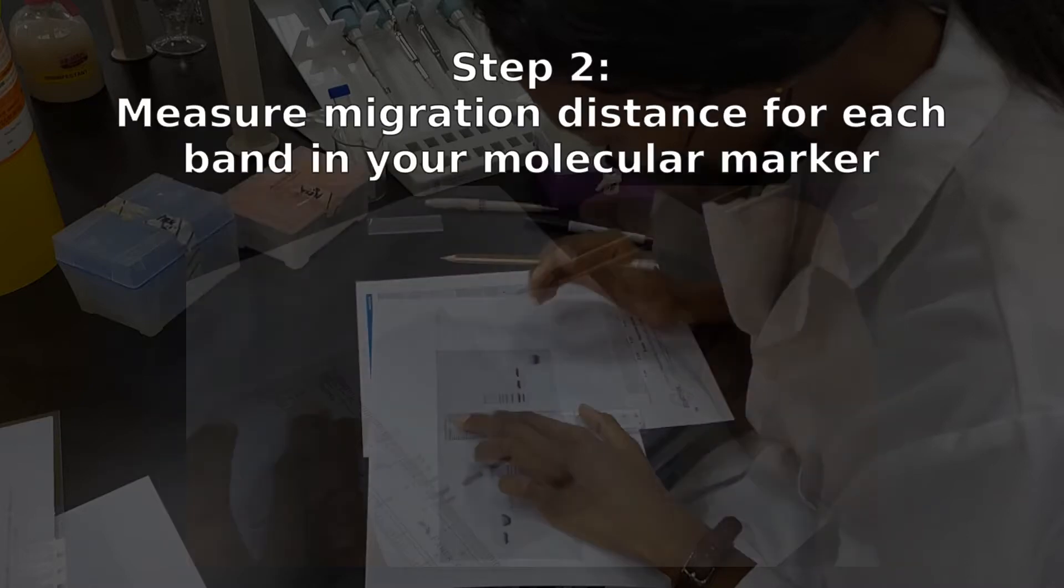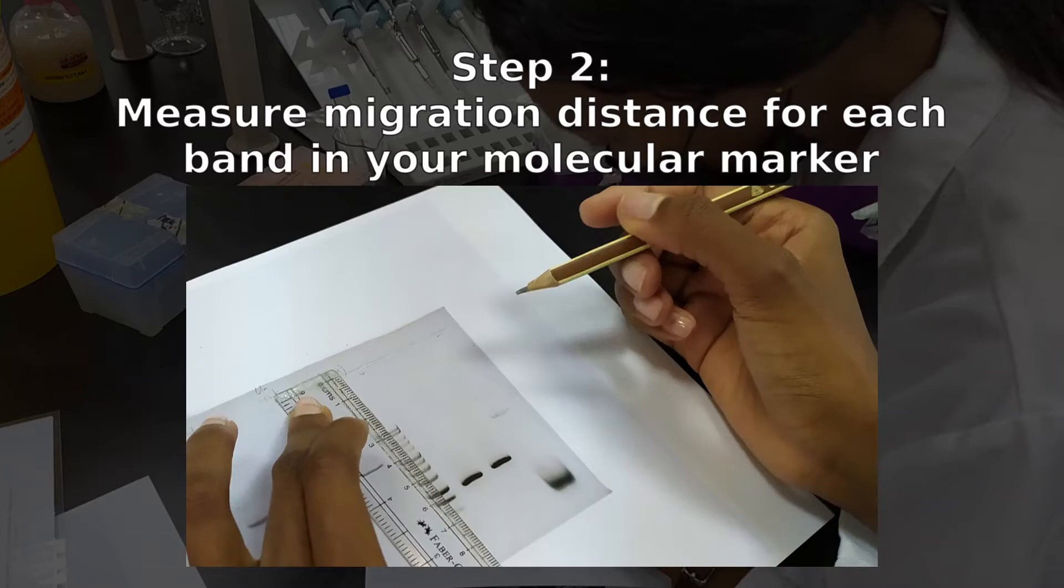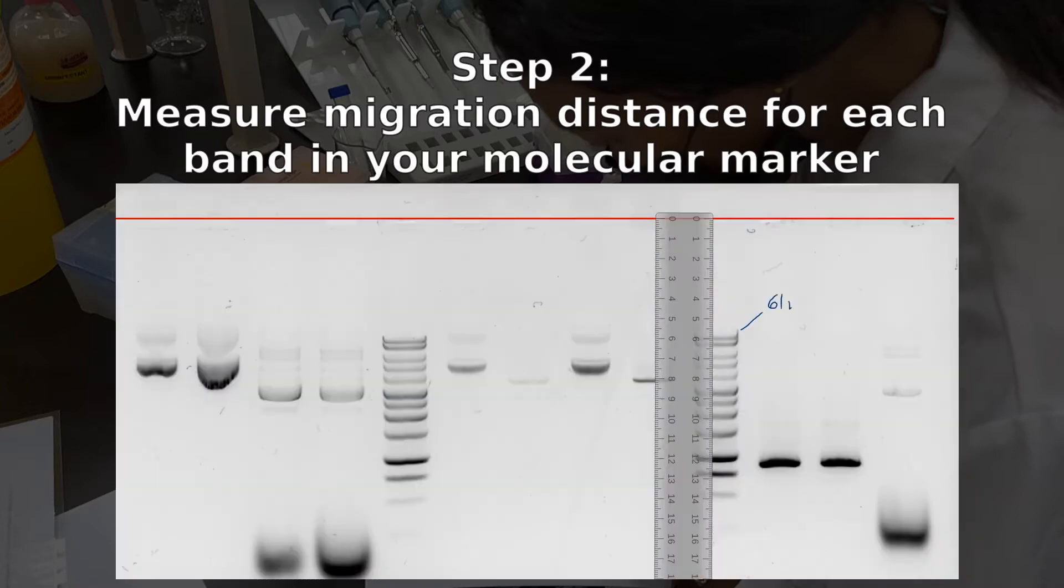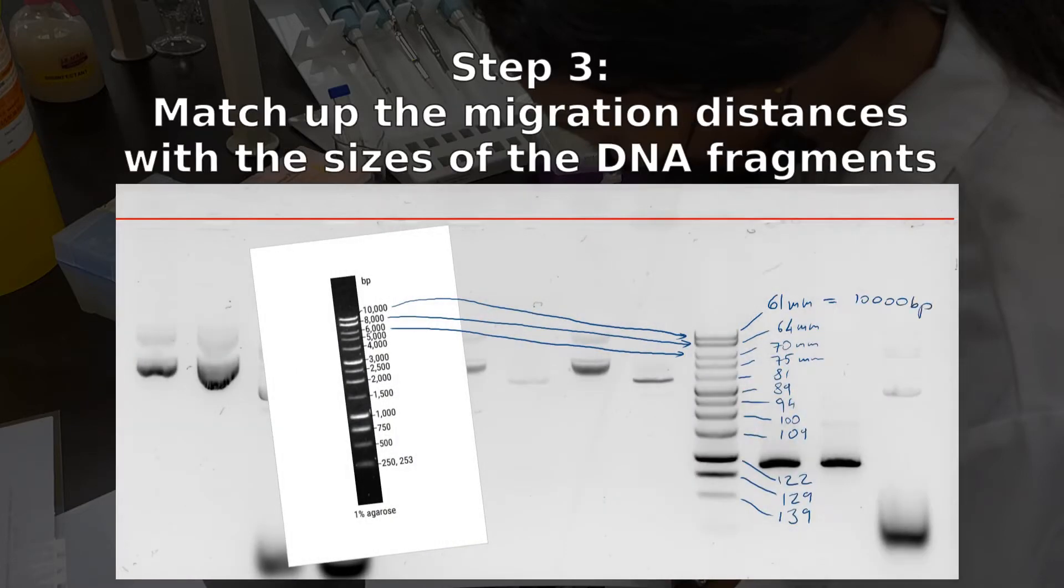You will then use this straight line as a base from which to measure the distance to each of the DNA fragments on the molecular weight marker. Basically, what you want to do is find out how far each of those DNA fragments has migrated. You will then assign sizes to each of those DNA fragments based on the molecular weight marker that you ran in the lab.